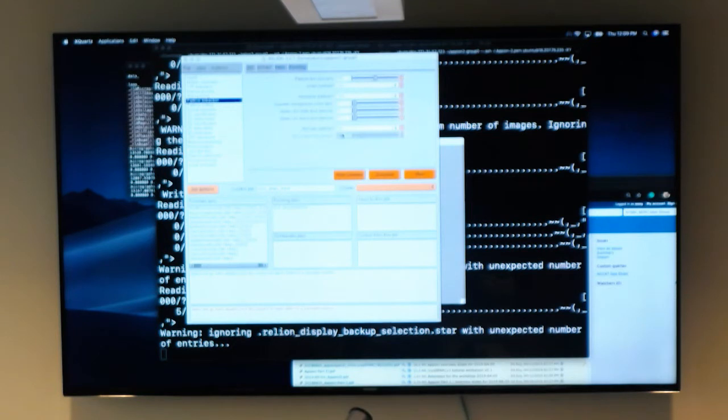It really depends on what you need to get from your data, and sometimes it is not so trivial to say, okay, can I see a distinctive feature in a binned state? Can I see it even in 3D classes? Maybe not. You might need to go all the way to refinement and do some of these more subtle techniques to get additional information for you to sort out.